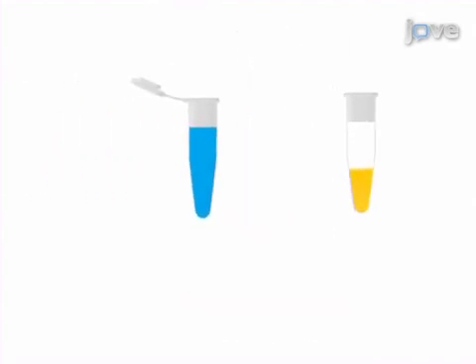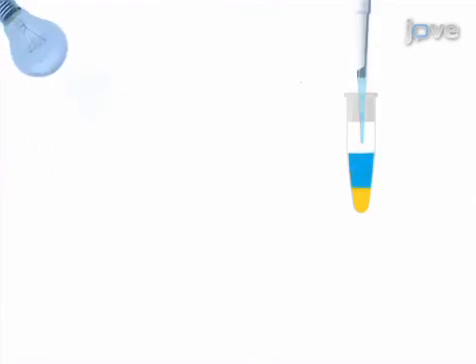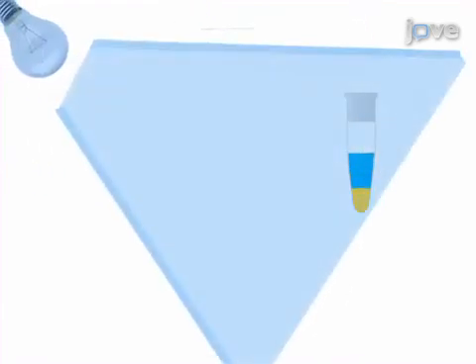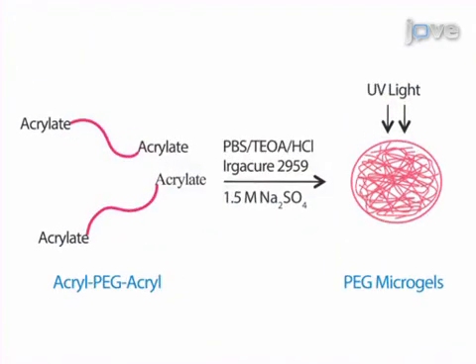Next, sodium sulfate is mixed in and the solution is placed under UV light to cross-link for 30 seconds. Following cross-linking, a cloudy layer on top of the solution will form which contains the microgels.